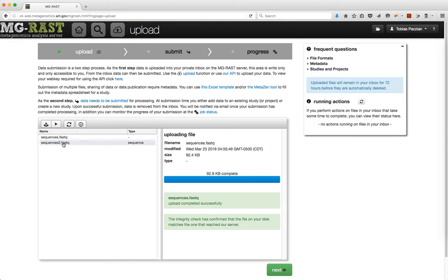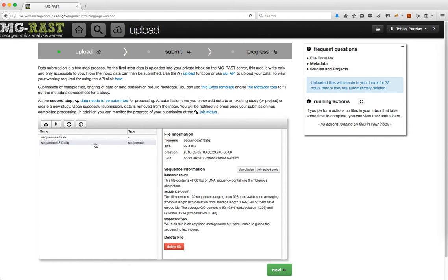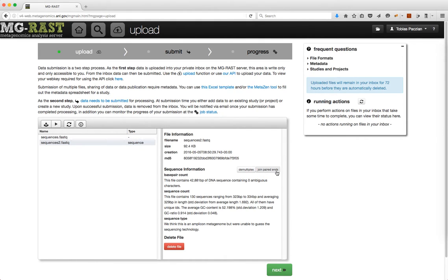When the sequence statistics have completed, you will be able to submit the data. You will also be presented with additional options like demultiplexing or joining paired ends.